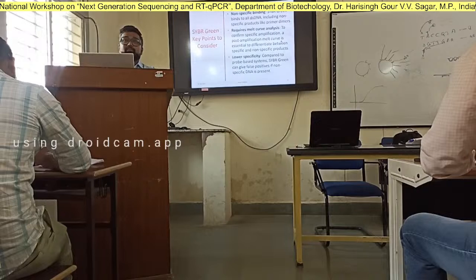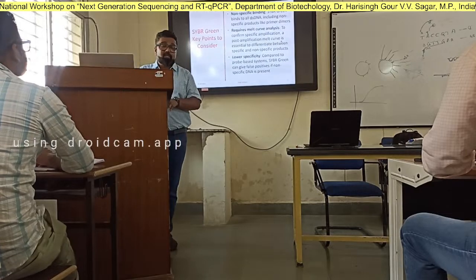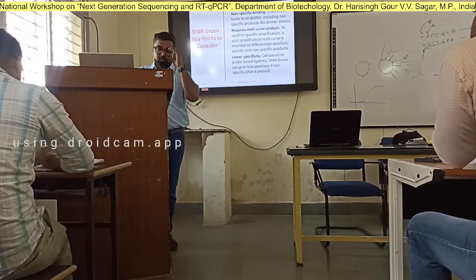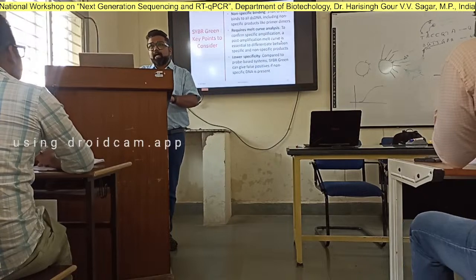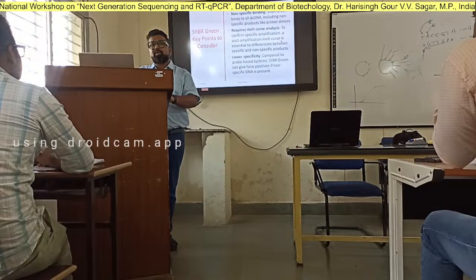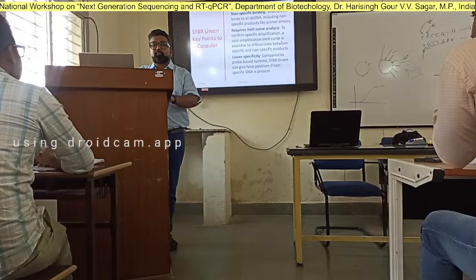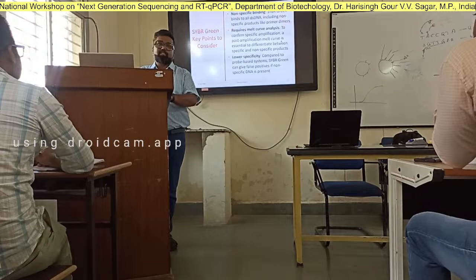Try to sequence the initial product, because I'm telling you from my personal experience. Sometimes I was working on a receptor, the follicle stimulating hormone receptor. I was very happy with my assay until I sequenced my product. My product, in BLAST search, showed homology both with the luteinizing hormone receptor as well as the follicle stimulating hormone receptor. You see, these act primarily through G protein, and my primers were in the transmembrane domain.